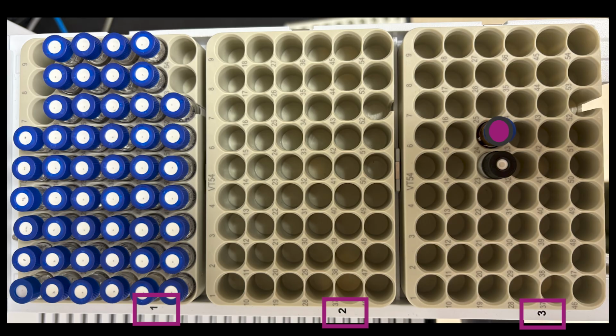One final note on vial positions is that I have been calling these trays, and I will continue to call these trays. In the software, these are referred to as racks. So instead of tray 1, 2, 3, it is rack 1, rack 2, and rack 3.